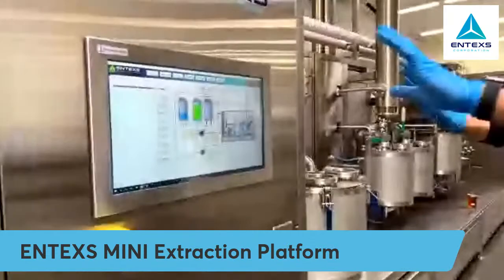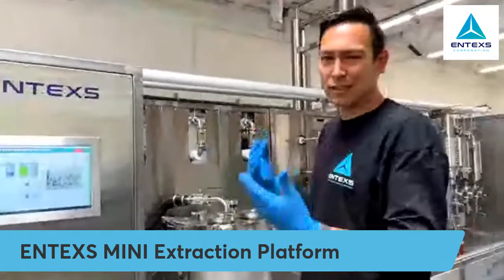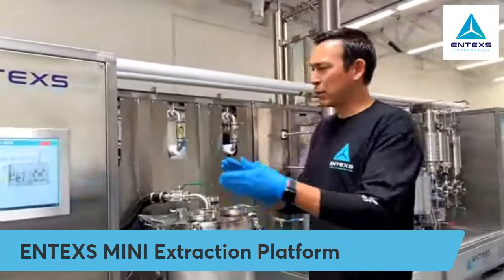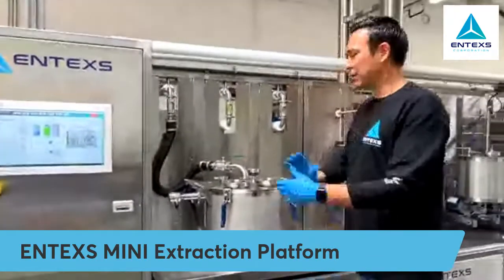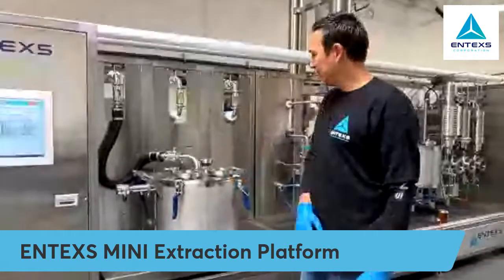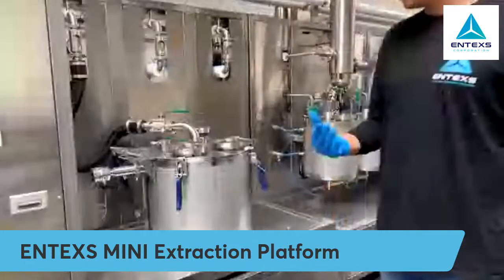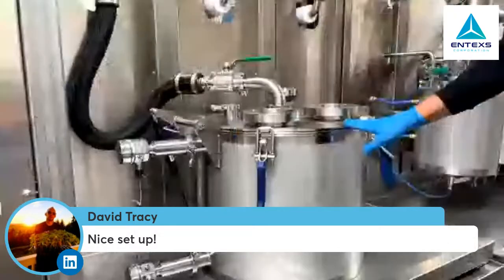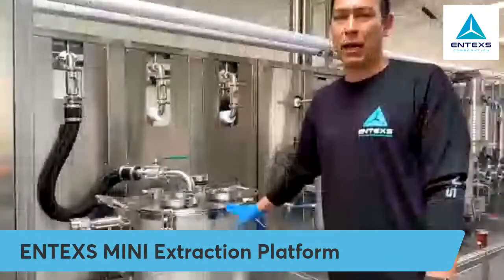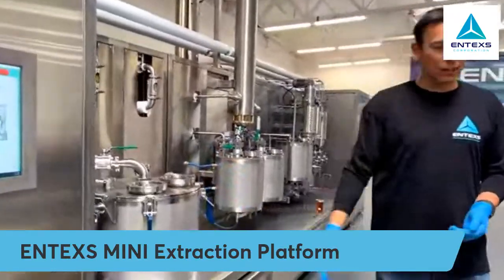We've laid this out into two interfaces: one for extraction and EVAP, and on the other side of the equipment we have the distillation interface, which is specific to distillation — it's its own unique process. So this is the extraction part of the equipment. Most ethanol extractors out there use this type of equipment — it's very similar. It's a batch centrifuge. We can hold up to around 40 pounds of biomass input depending on your density. We designed it to run 20 pounds, but with ground biomass we can run up to 40 pounds.